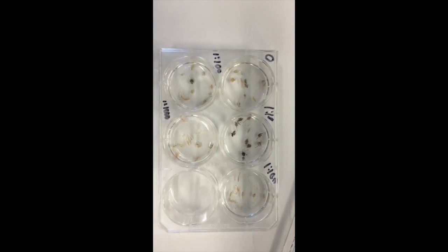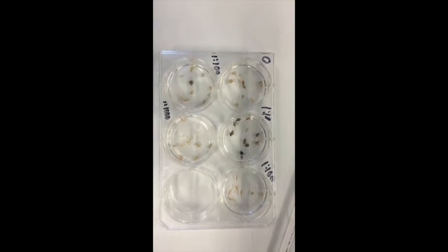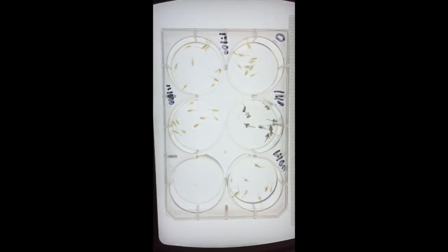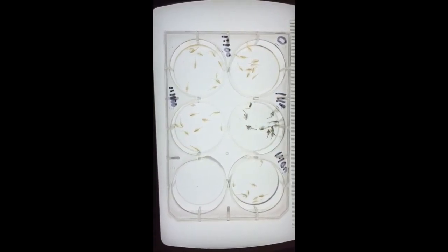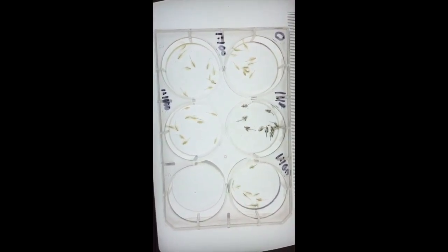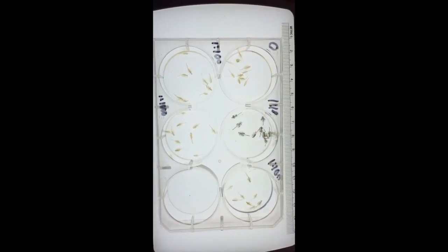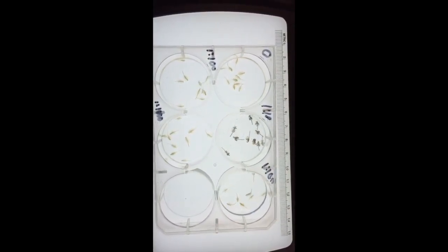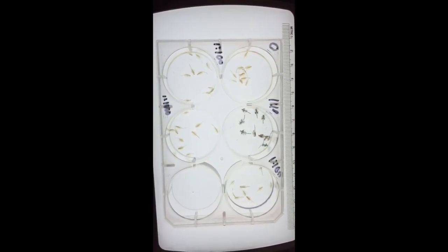Day 3 observations showed that 90% died in the 1 to 1 ratio well, 80% died in the 1 to 10 ratio well, 100% died in the 1 to 100 ratio well, and 100% died in the 1 to 1000 ratio well. The safest concentration of brine shrimp was the 1 to 10 concentration, which had 1 milliliter of stock solution and 9 milliliters of seawater. The safest concentration was determined by observing the number of living shrimp on day 3.